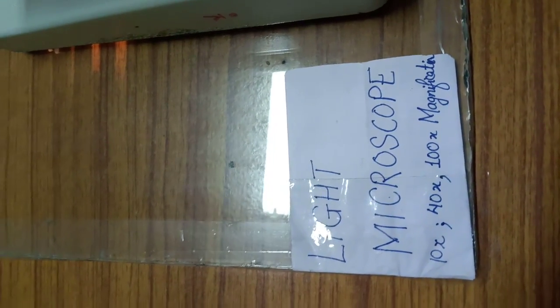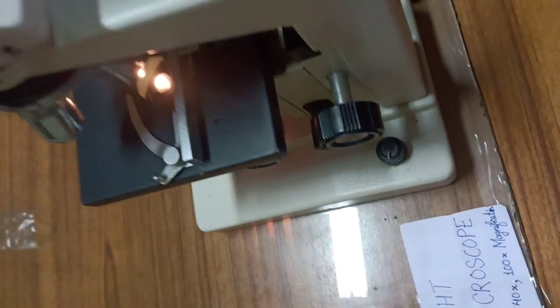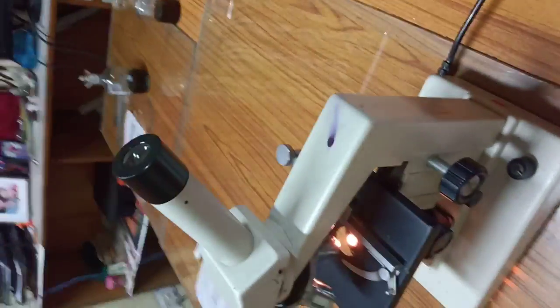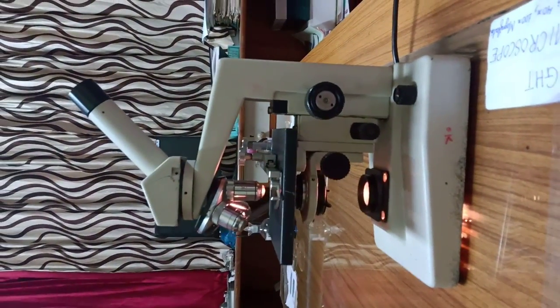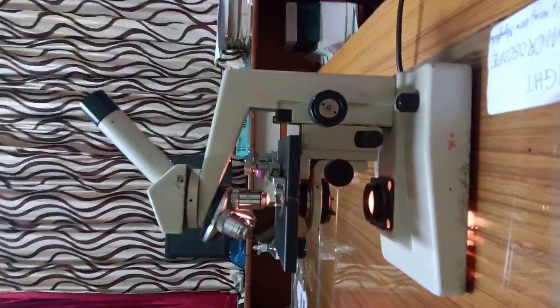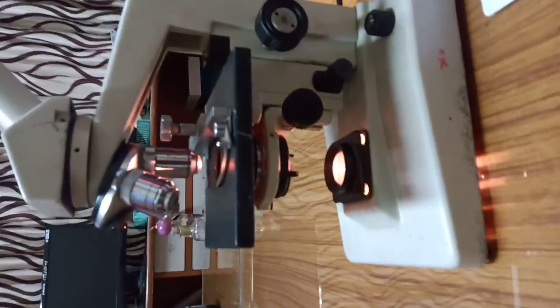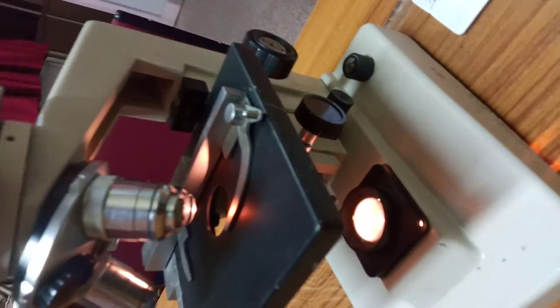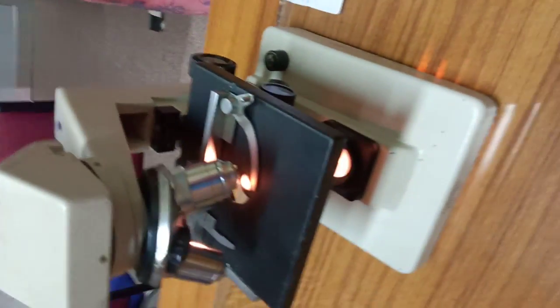The use of microscopes for studying cells is called basically microscopy. The first microscope was designed by Robert Hooke in 1665. The microscopes are instruments for making enlarged images of ordinary invisible objects which are not visible to the naked eye. The microscopic objects are measured by units such as microns and angstroms.